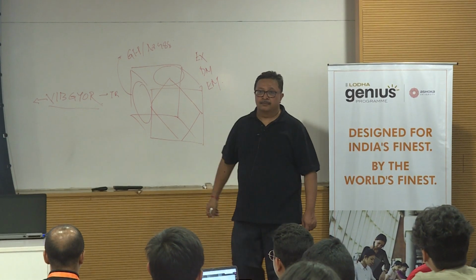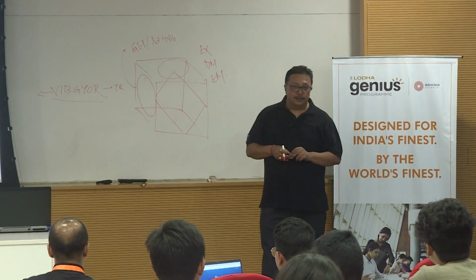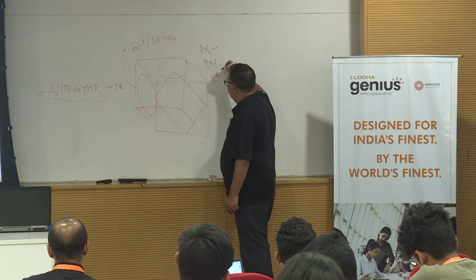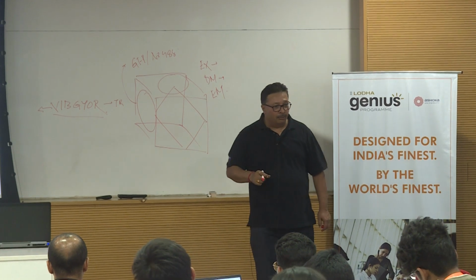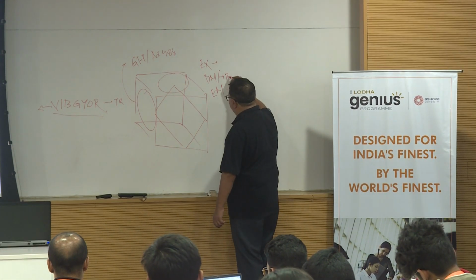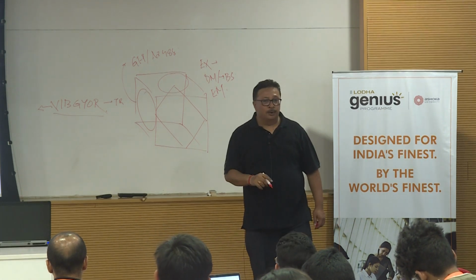What is EX? Excitation. So, what is the excitation wavelength? What is the dichroic mirror? DM stands for dichroic mirror, or some nomenclature will say BS, beam splitter. And the third thing that you will see is EM, emission filter.